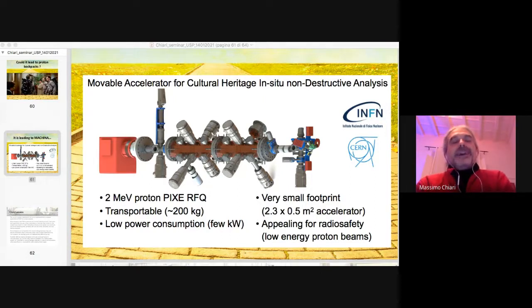Another large improvement will be, for example, trying to have high resolution PIXE detectors. But then, you can try to replace one detector with a more innovative one. Currently, we are not thinking of large technological improvement in IBA.